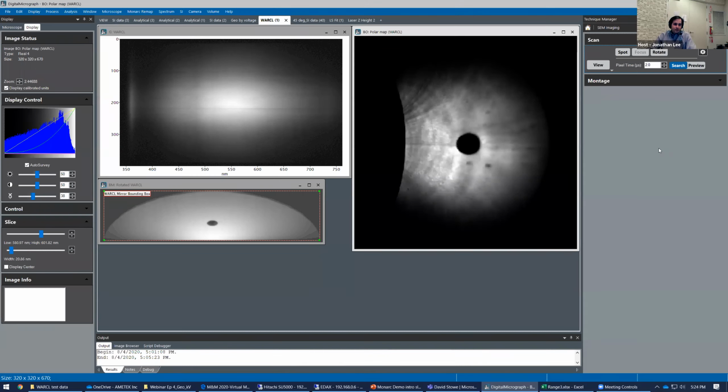Also, some specimen like gallium oxide, for instance, won't emit at the band gap at room temperature. So it has a more efficient recombination pathway in the defect band. When you cool gallium oxide, you start to change that behavior, and you can start to see the band-to-band recombination at very low temperatures. So there's an alternate pathway for recombination in that case.